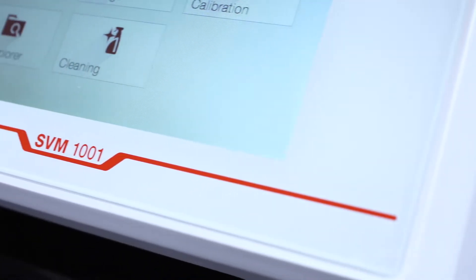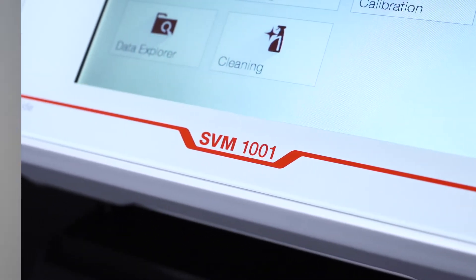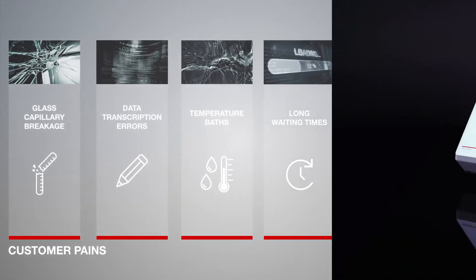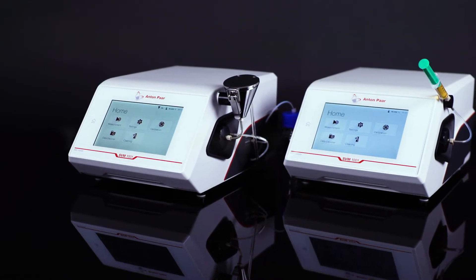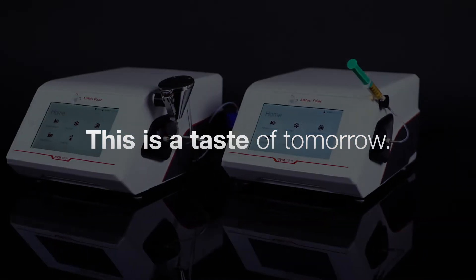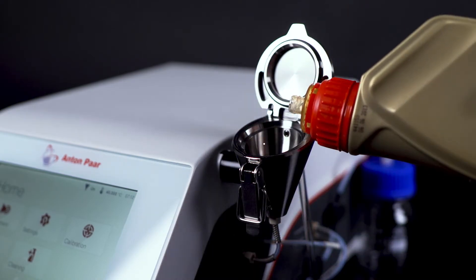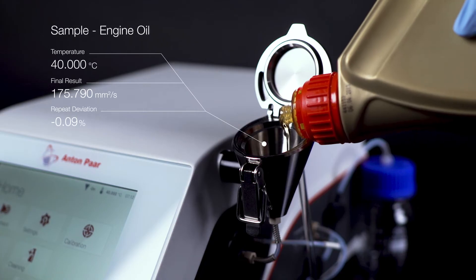Glass capillary breakage, data transcription errors, temperature baths, and hours of waiting—all a relic of the past. This is a taste of tomorrow. Get kinematic viscosity values out of a single filling, delivered automatically and digitally within 60 seconds.